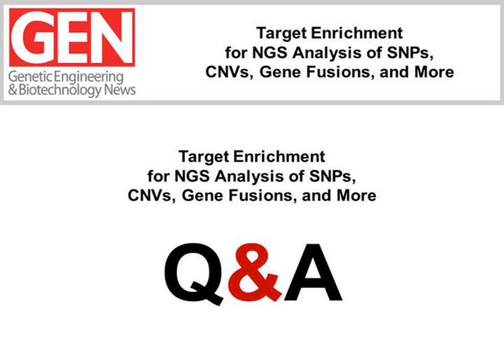All right. What is the lowest input level that you would recommend for FFPE samples? So this is Steve. We did discuss some data using FFPE during the webinar. Our stated minimum input level would be 10 nanograms for FFPE samples. But you will note that the duplication rate and the uniformity is improved at higher levels of input. So if you have samples available to go to higher levels, say in the neighborhood of 50 nanograms, that would be preferable. But the minimum input level is 10 nanograms.